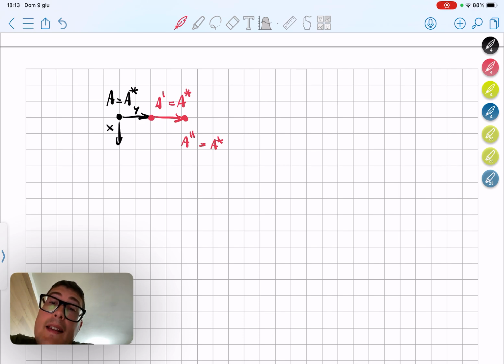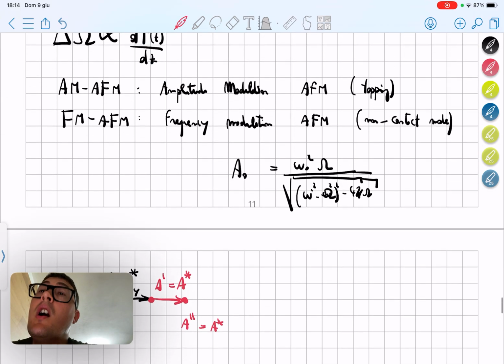We should keep in mind that we might not have a precise understanding of where we are in a distance-like position, so we don't know where we are, but what we know is the relative displacement, in terms of amplitude or frequency, as we are mapping the sample.